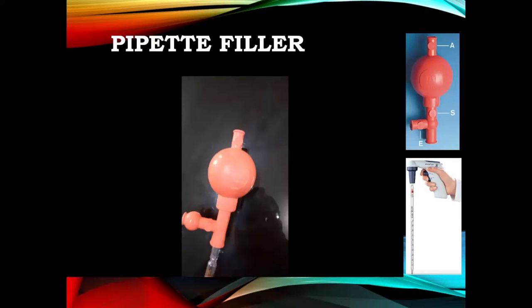Now this is the pipette filler. There are two types of pipette filler. One is this and one is this. This is the most commonly used, and this is a very modern pipette filler. Both have the same function. I will discuss only this one because this is common here in our colleges and schools.